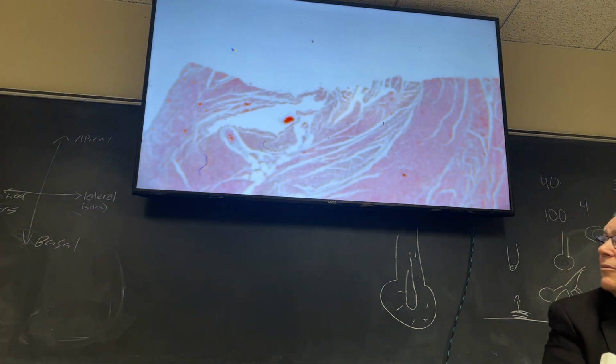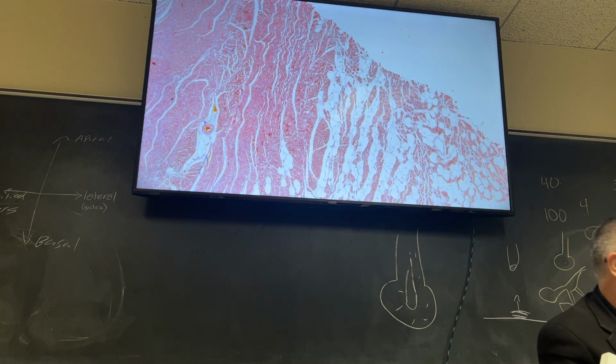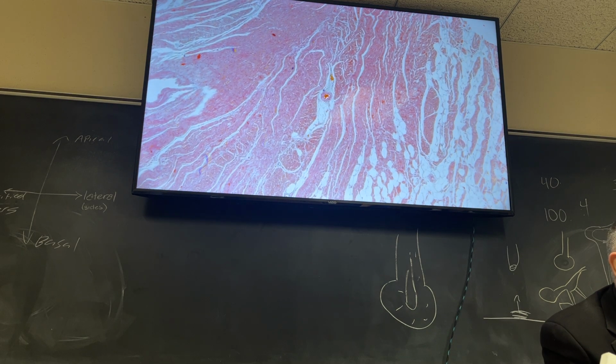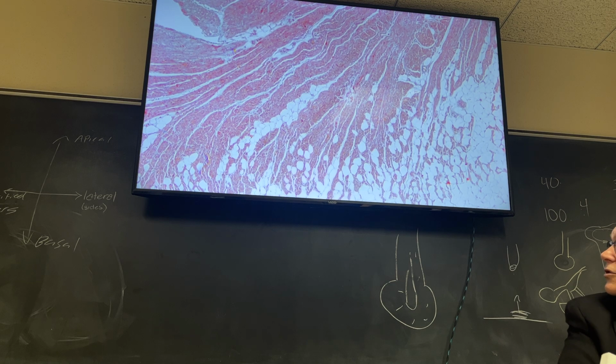And there is a modified muscle cell that does that work. And what's it called? Purkinje fiber, right? So let's look at Purkinje fibers. And Purkinje fibers are easy to see. So this is heart tissue. That's my lowest power. So we're just going to wander around until we find something that doesn't look right. It's heart muscle, and we're going to go around until we find something that looks weird, right? I hate that what's in focus for me is not in focus for you.